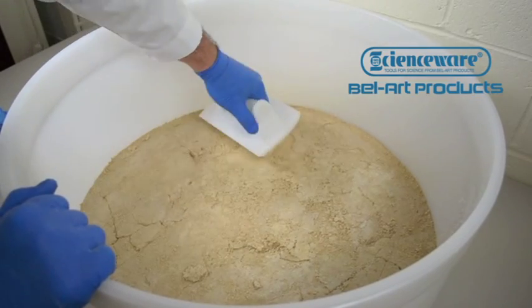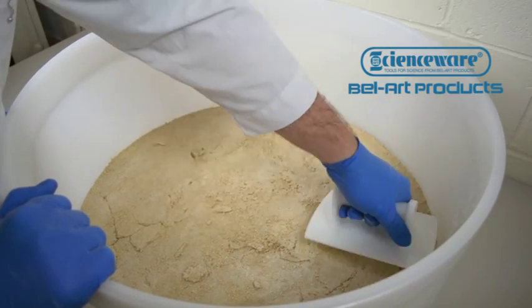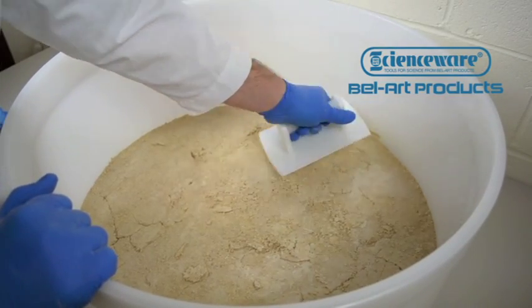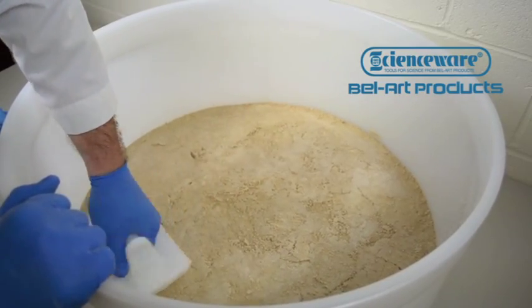FDA-grade high-density polyethylene provides maximum chemical resistance, which is perfect in pharmaceutical, R&D, and manufacturing situations where harsh organic solvents are common.